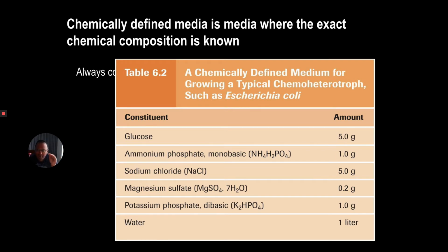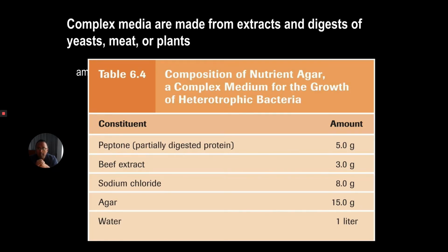So chemically defined media, I know molecule for molecule how many molecules of glucose there are, how many molecules of this there are, etc., right? So that is a chemically defined media. I have a really good idea of what's in the media. Okay, so this is a chemically defined medium to grow Escherichia coli. Now, we also have what's known as complex media.